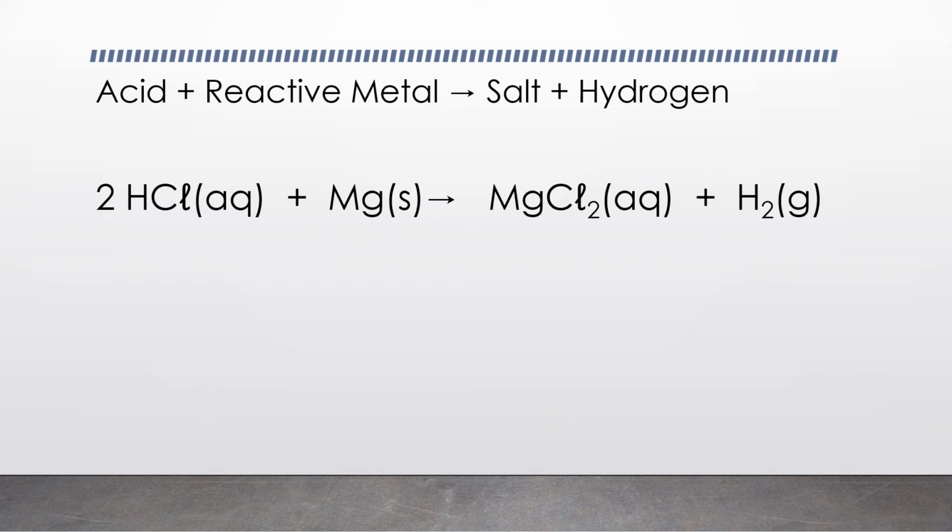So observations: colourless solution, silver metal, silver solid, colourless solution, and a colourless, odourless gas.